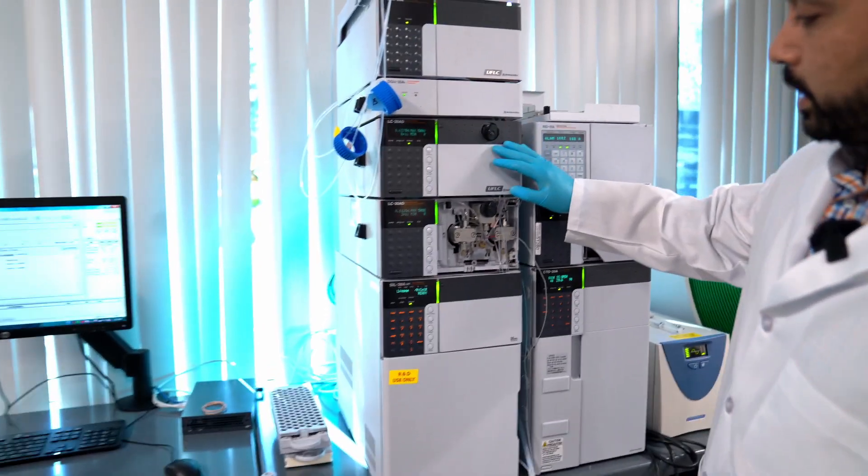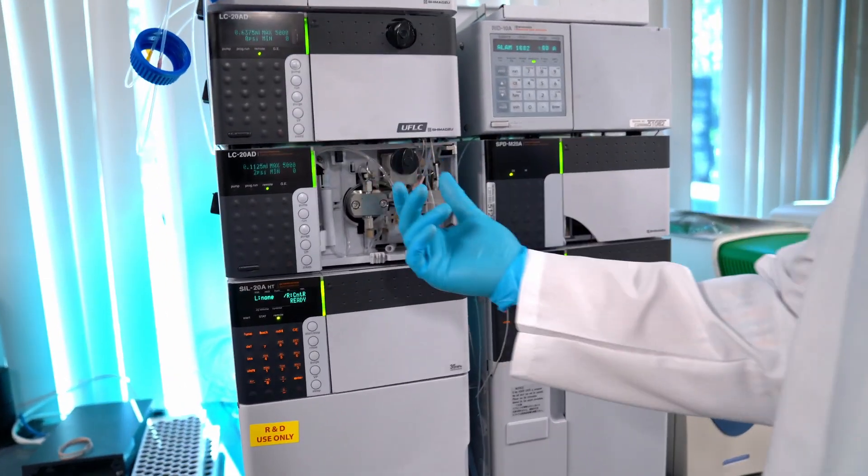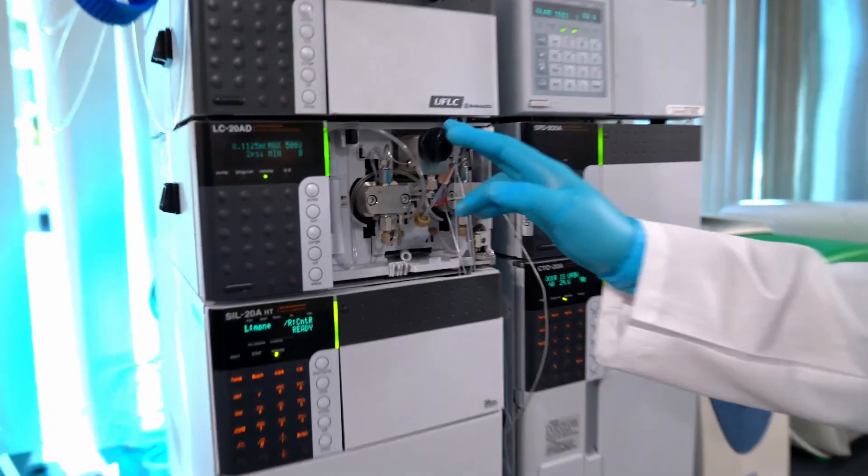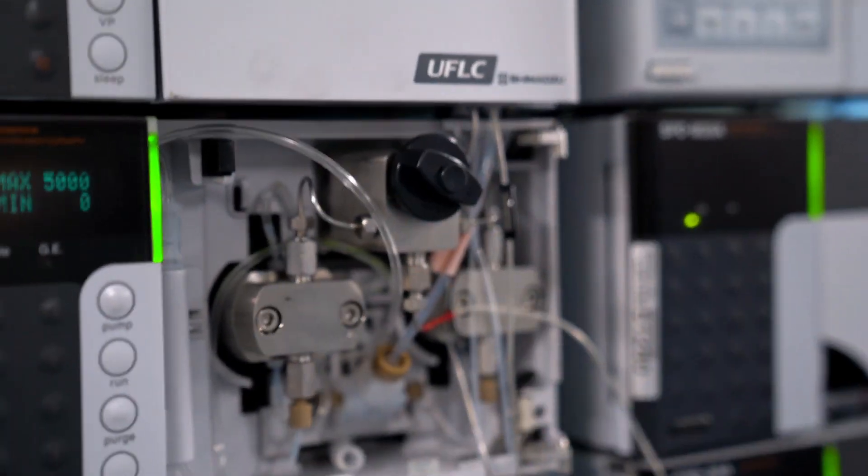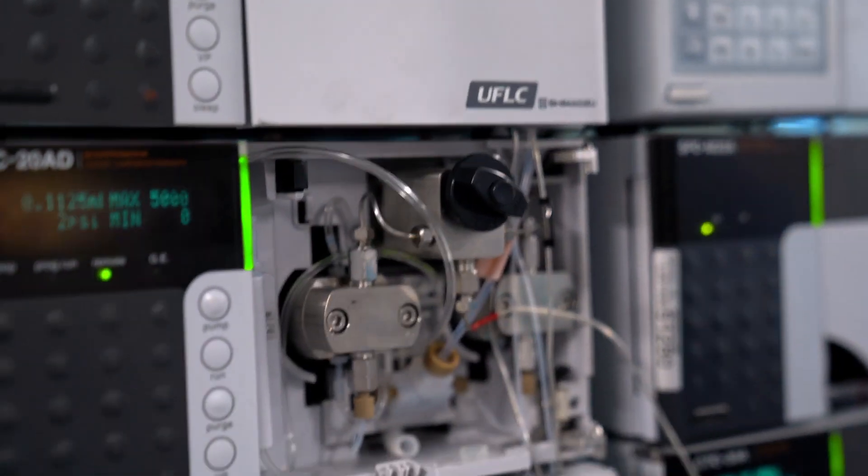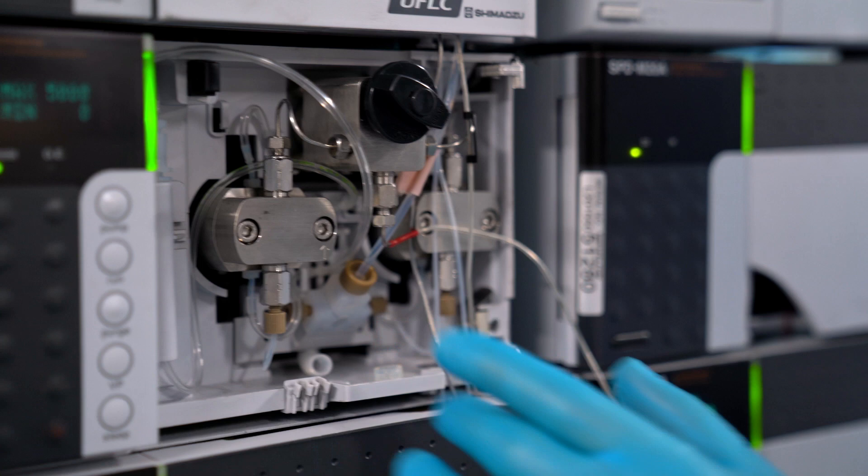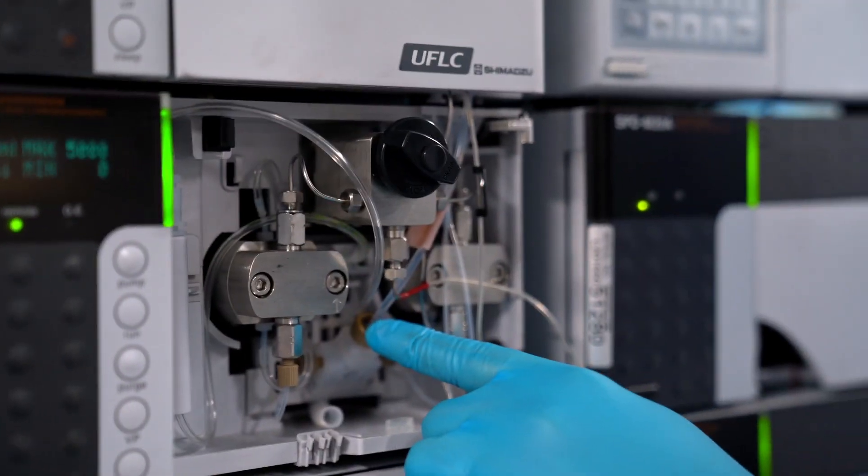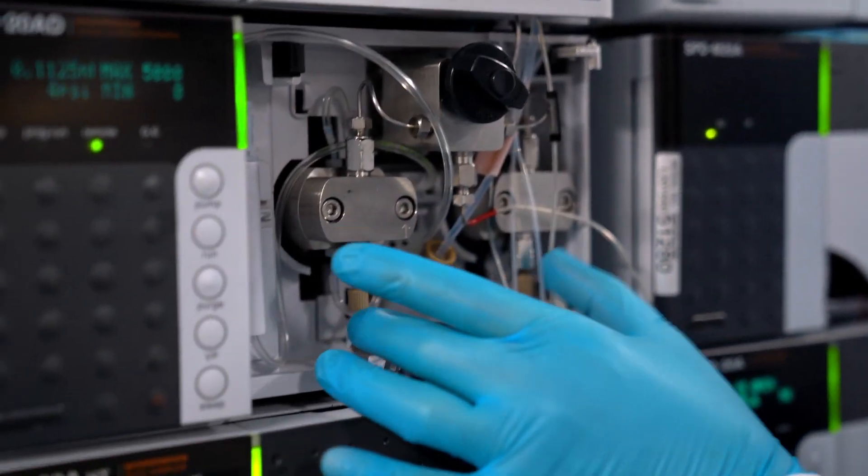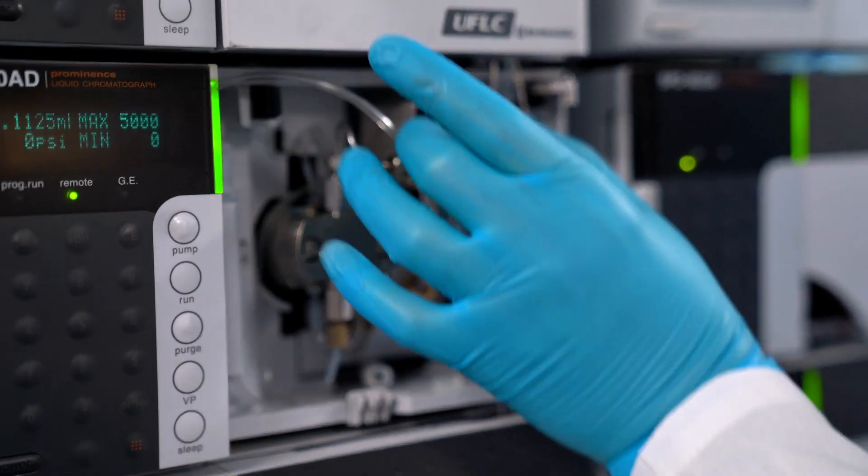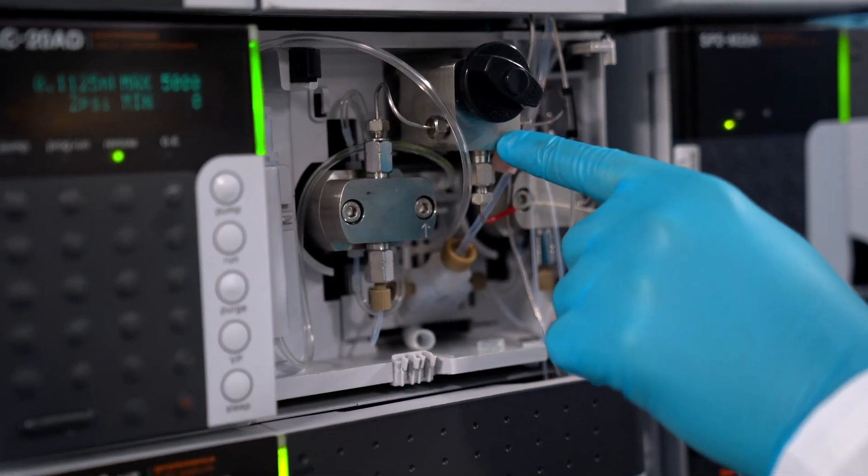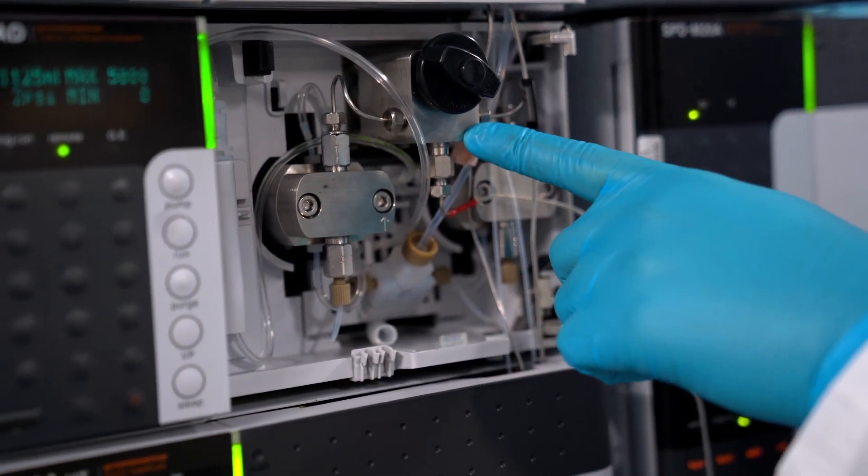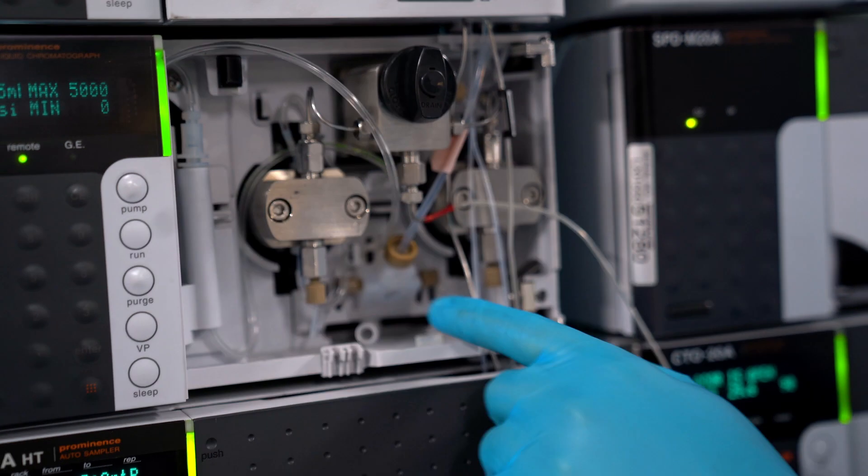Here are the pumps and this is the drain valve. All you have to do to open the drain valve is twist it like that and then that's open. The way the pumps work is the mobile phase comes in through here, comes up through the check valves and then into the drain head here.